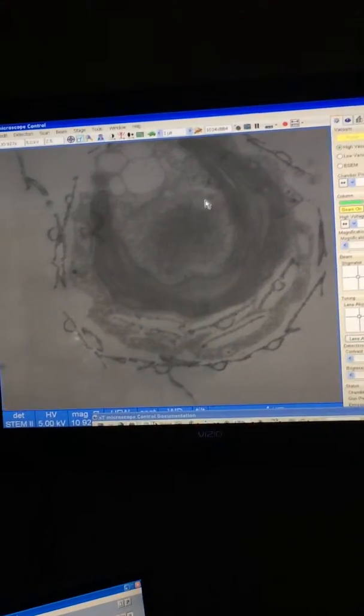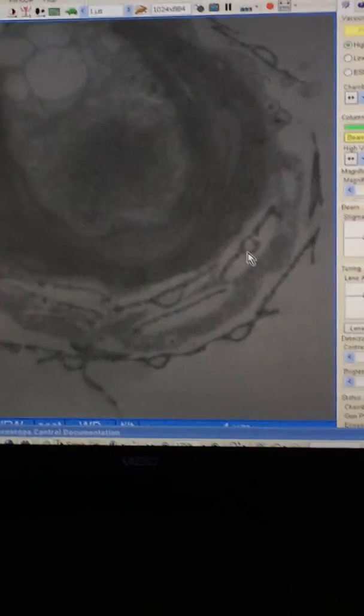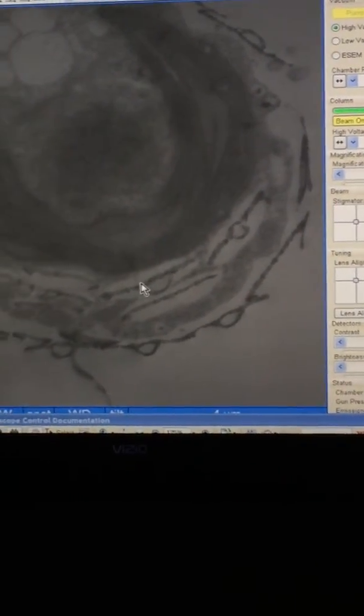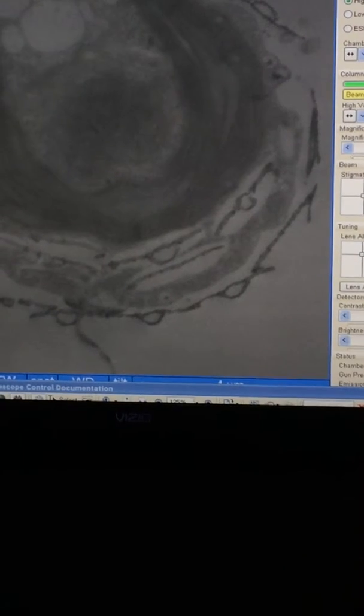So this here is the edge of the Golgi apparatus. Here you can see this is cytoplasm out here. This is one of the chloroplasts. And here you have these vesicles inside the cell. So this is down near the side of the cell away from the flagella. And so these are now ready to be secreted because these look like fully formed scales inside here. So here you see the scales. They look like sombreros out on the outside of the cell body.